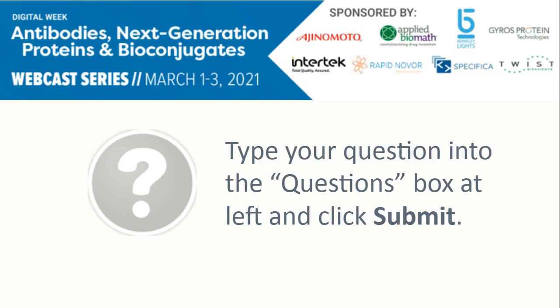Okay, great. Next question. Are you able to take a PAB without those cells and get the sequences? Yeah, good question. At this time, no. You really do require that we have the accompanying B cells for the polyclonal antibody sample of interest because we do need to do the B cell repertoire sequencing. We really need the NGS data in order to faithfully recapitulate the full-length sequence as we're assembling all those different peptides from the poly sera into the most dominant antibodies that we can observe from the proteomics.